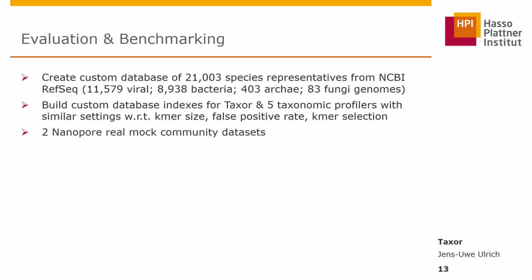For investigating read classification metrics, we chose 2 publicly available nanopore real mock community datasets and 1 PacBio HiFi mock community. For these datasets, we created a ground truth by mapping the reads to the reference genomes provided by the manufacturer of the mock communities.